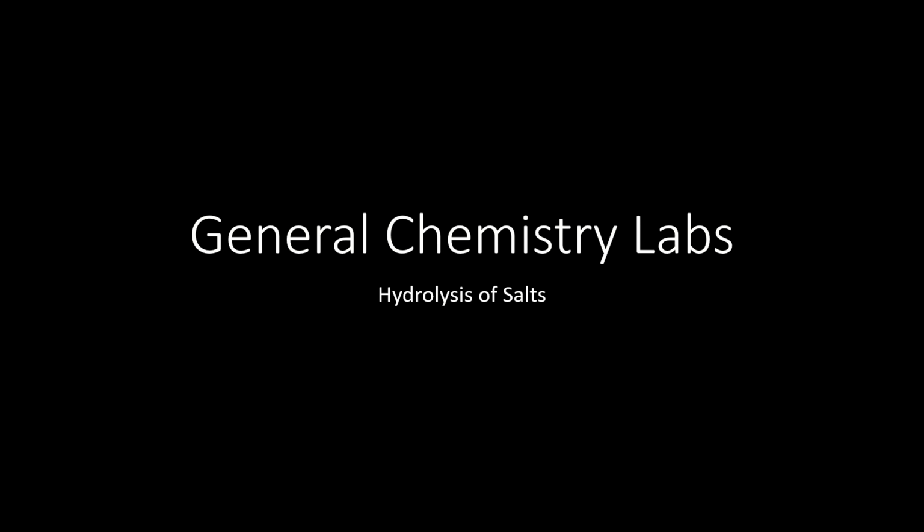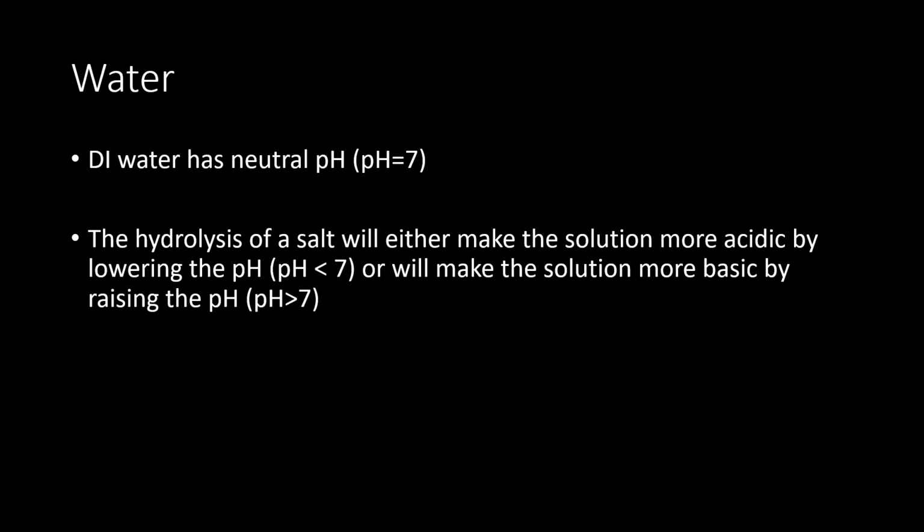Hello, General Chemistry Lab. Here we're going to be going into the inner workings of the hydrolysis of salts lab. Essentially, what happens when you add a salt to water, and as that salt dissociates into its anions and cations, are they going to interact with water? And in doing so, affect the pH of a solution.